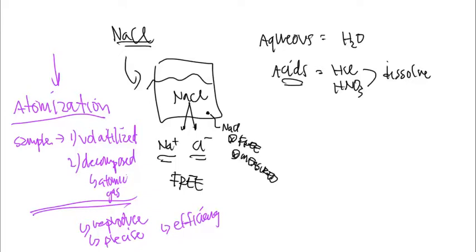Okay, so we'll talk a little bit more about the atomization process and about what it does, but that's basically what's going on. You've got a compound that probably has a metal attached to it. That compound has to be broken up, like sodium chloride is dissolved up in a way, and you have to send that through the machine. It gets rid of the solvent, and therefore sodium and chlorine get presented into the machine and not the liquid solution itself. And that's the process of atomization.